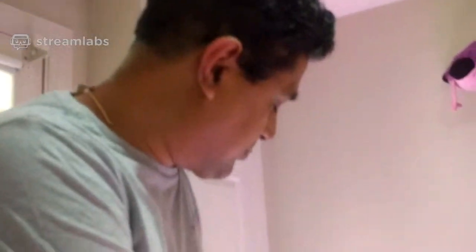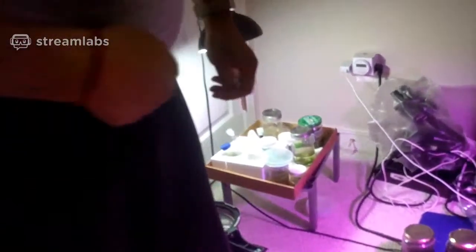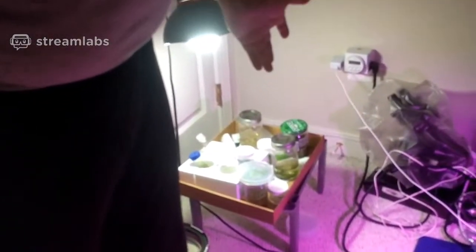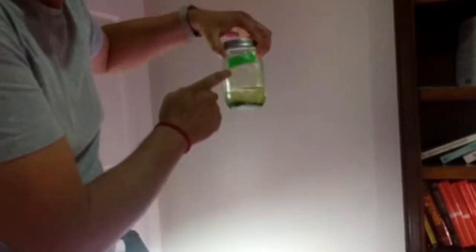And I just left it out here. And after two to three months, when everybody was screaming at me about my bottles, I went and looked inside, and there was this extraordinary ciliate called Paramecium bursaria. I still have it. This has been going on. Let's look at the date. No date on this, but this is over six months old, and it has survived this long. Why is that? We'll find out shortly. So that is one. Another extremely long-lived culture I have.